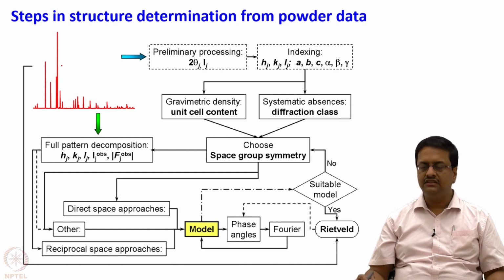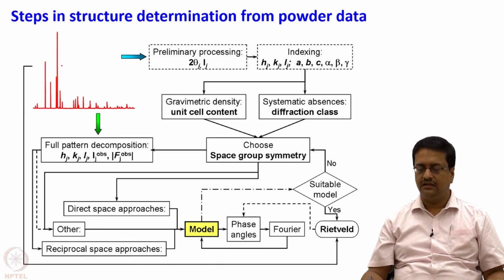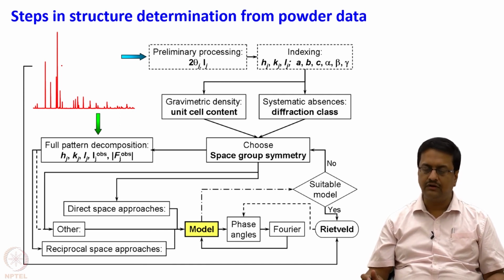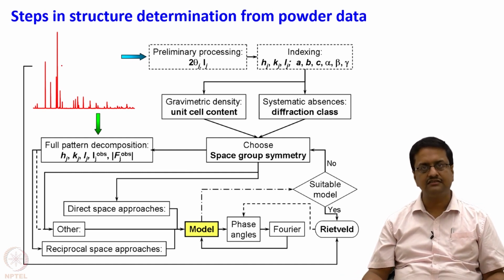Now in this busy slide, I will explain the steps in determination of structure from powder X-ray diffraction, which I must say is one of the most difficult tasks to do in X-ray crystallography. But there are research groups who work on these for various samples where one cannot generate single crystals, or some phases only exist in powder form and change form when recrystallized, and so on.